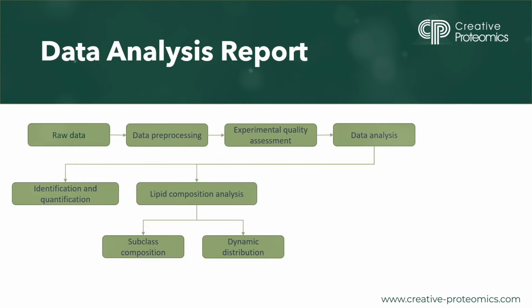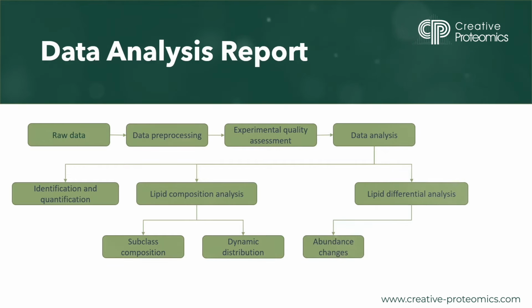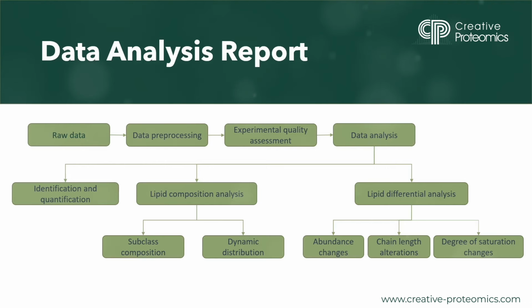One important aspect of lipidomics analysis is the identification of differentially regulated lipids. We compare the abundance of lipids between sample groups to identify significant changes. Statistical techniques such as t-tests or ANOVA help us determine the significance of these abundance changes.